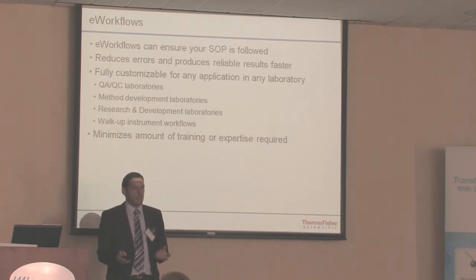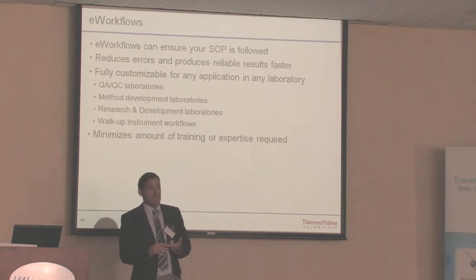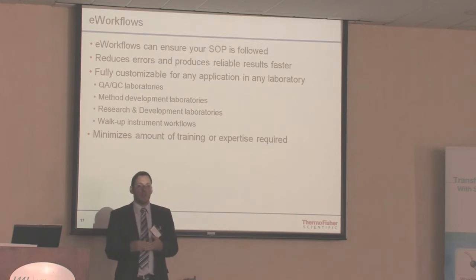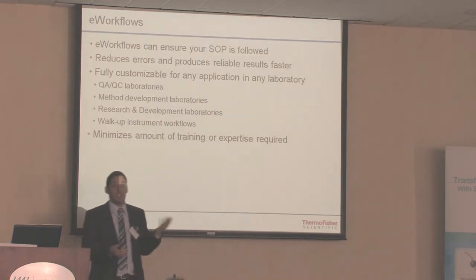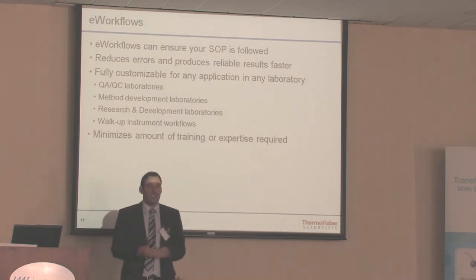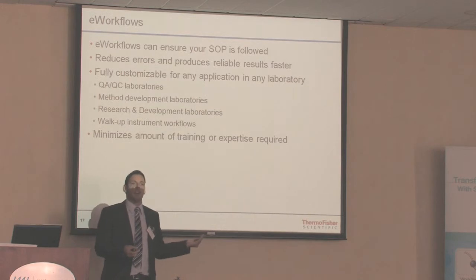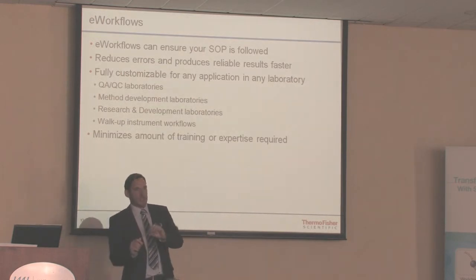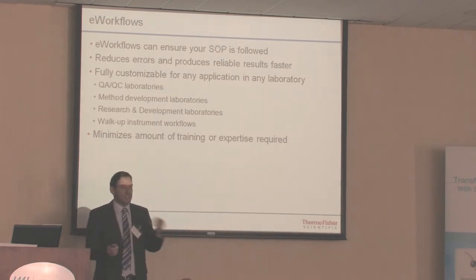So it's already been set up by someone who knows what they're doing, by someone who knows that what they're setting up actually works. Because of that, you can attach certain things when you work. Like you can attach an SOP to it, you can attach PDFs, Excel, Word documents, videos if you want to. You can attach bitmaps, anything you particularly want to aid you. It could be a file map, for instance. That's what we get routinely. Where someone has to make a change to something, they can attach the file map. And you can rename it with a phrase that says read me if it's particular recordings.